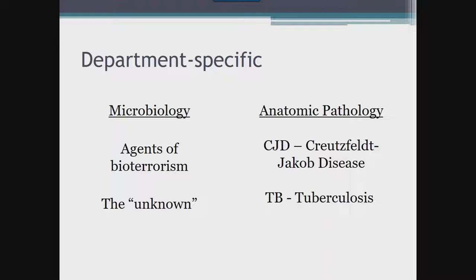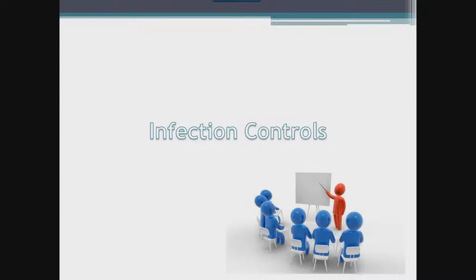Frozen sections and autopsies introduce exposure to tissue in its fresh state, and therefore risk is higher when performing these procedures. I wanted to mention CJD specifically for awareness, because the safety precautions associated with this agent are extensive — beyond the scope of this presentation — but you should familiarize yourself with those policies and procedures in your laboratory. After going through the types of exposure risks that exist, it is comforting to know we can minimize these risks with a number of different infection controls. These controls are only as good as everyone's compliance, so it is important that staff follow the processes set out for them.